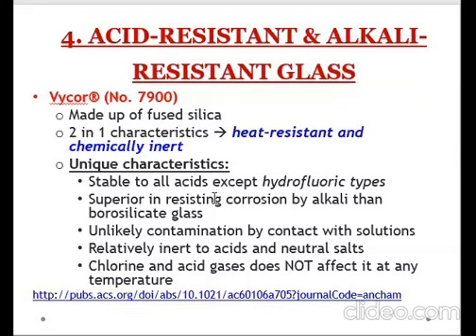So, perhaps maisip nyo na, hala, may silica man din yung other categories of glasses kanina. So, it is safe to assume, class, na meron din po talagang effect si hydrofluoric acid dun sa mga previously discussed na categories of glass. Okay?